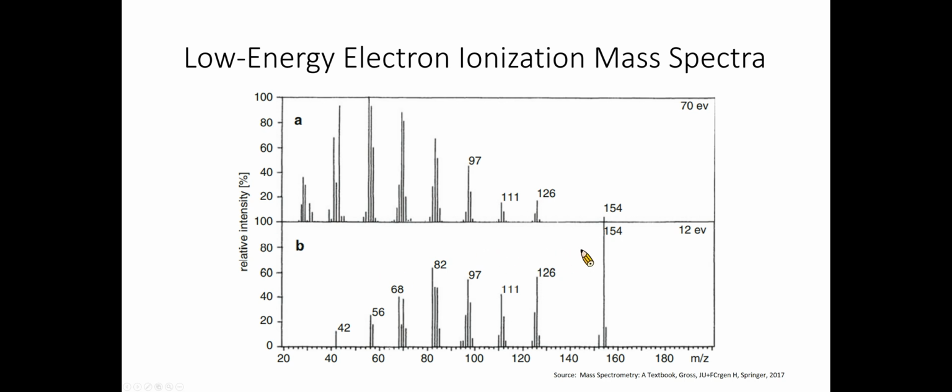Superior EI mass spectra of large hydrocarbons can be obtained, even more so if the ion source is operated at 70 Celsius degrees instead of 200 Celsius degrees. Low energy, low temperature mass spectra are much easier to interpret than their conventional 70 electron volt counterparts for several reasons. First, the relative intensity of the molecular ion peak is enhanced, thus permitting this important peak to be identified more easily. Second, less fragmentation also means a simpler overall appearance of the spectrum. Third, the fragmentation pattern is dominated by a few characteristic primary fragmentations, carrying a large portion of the structural information.